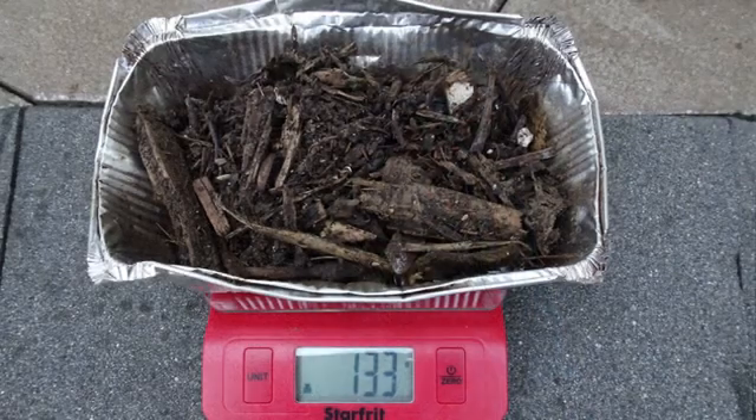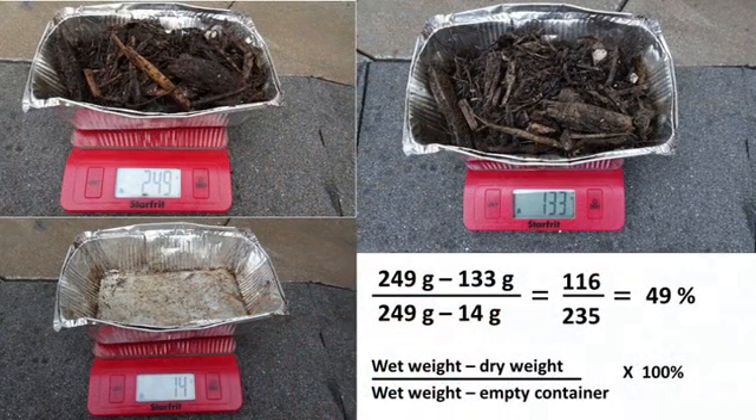Smaller samples may dry faster, but larger woody bits need the full 24 hours. After the 24 hours, the tray with the dry compost is weighed, allowing the moisture content to be calculated by: the weight of the wet compost and tray minus the weight of the dry compost and tray, then divided by the weight of the wet compost and tray minus the tray. The resulting fraction is then converted to a percent moisture.